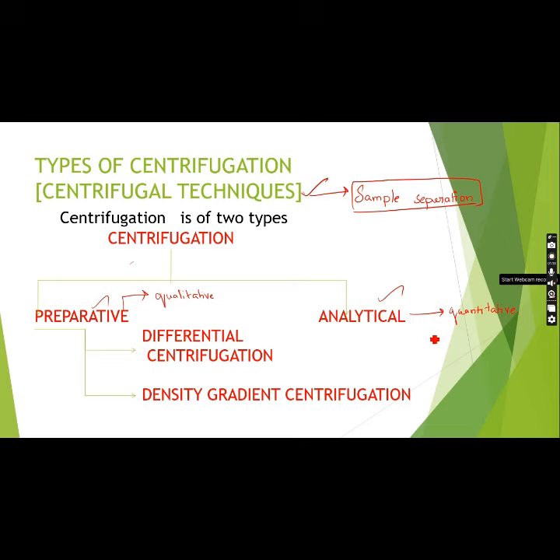That means even small molecular weight changes can be accounted for, and the sample can be separated even though there is only a small molecular weight change to be found.